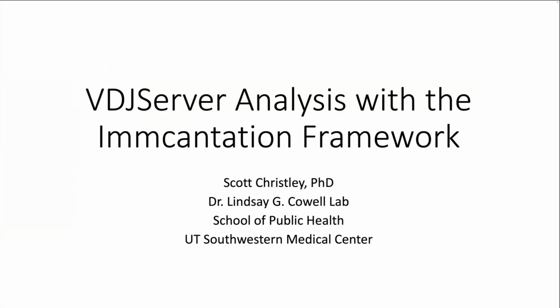Hello, everybody. I'm Scott. I'm a computational biologist in Dr. Lindsay Cowell's lab. Our lab has three sort of main focus areas. We do method development, so new algorithms, analysis, lately sort of machine learning algorithms for immune repertoires.